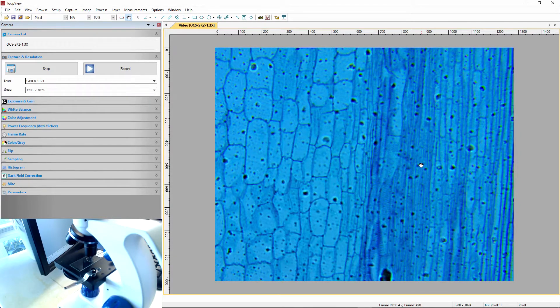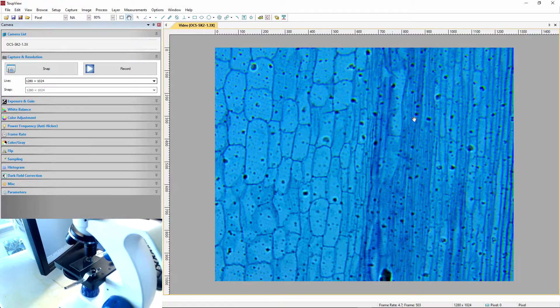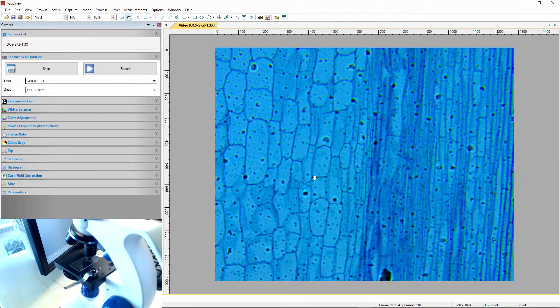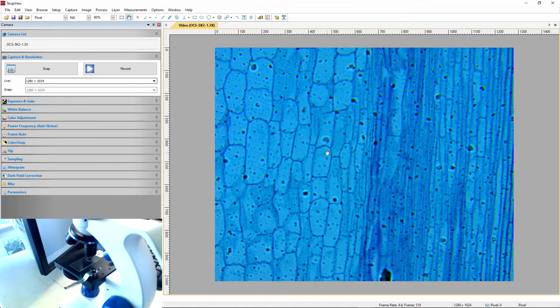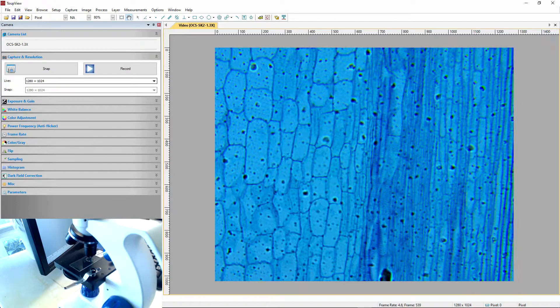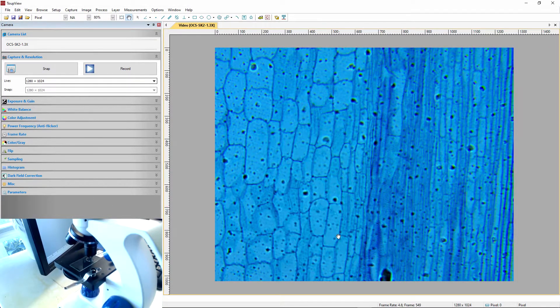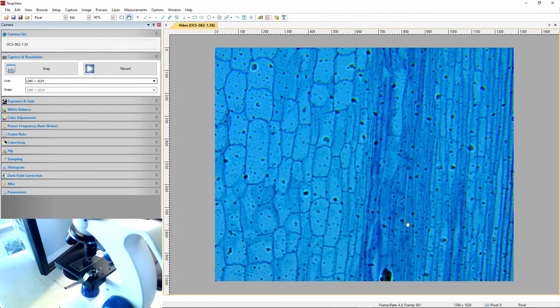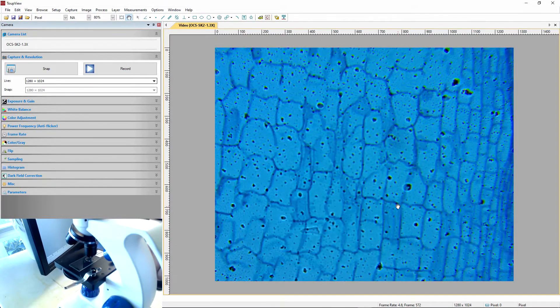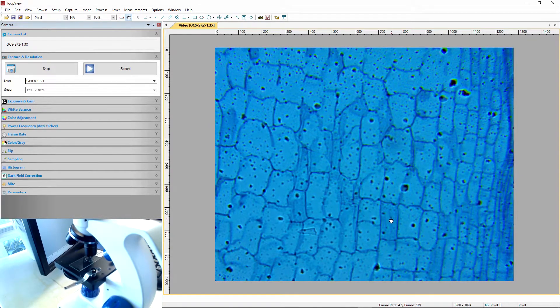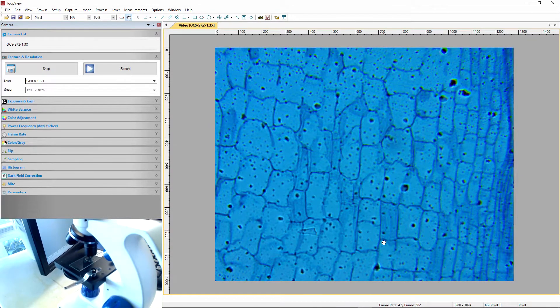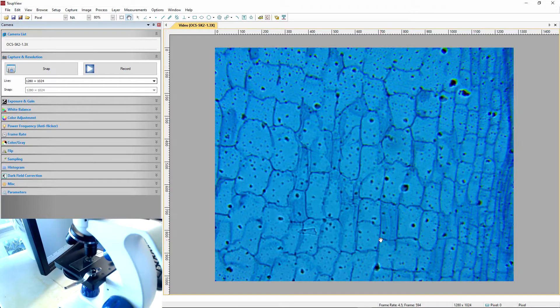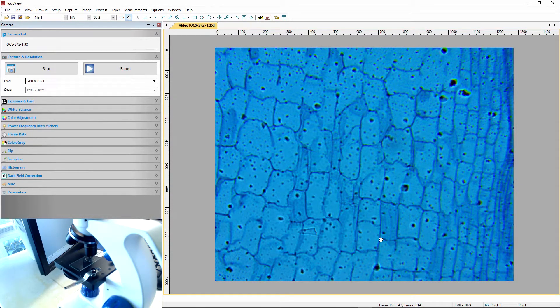There's dust. There we go. So, this. The stem goes up and down like that. And then this is the tree cells. They're kind of square. The little dots, like these dots, are just dust on the slide. I wish we could move around. I'll move around with my hand a little bit. Let's see. Here's more cells. This is just all cells. Little squares. This isn't very interesting.